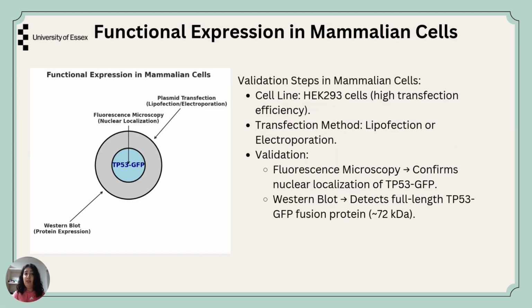To validate TP53 expression, I will transfect HEK293 cells using lipofection or electroporation, use fluorescence microscopy to confirm TP53 localization, and perform Western blot analysis to detect the TP53-GFP fusion protein. These experiments will confirm successful TP53 expression and localization in living cells.